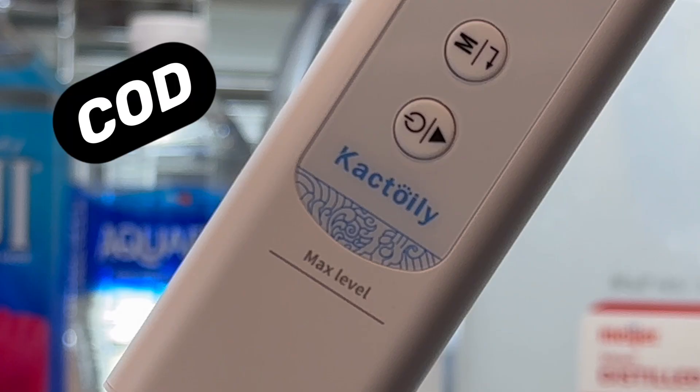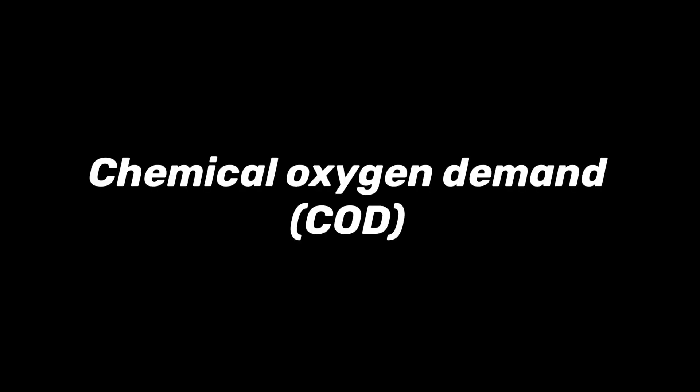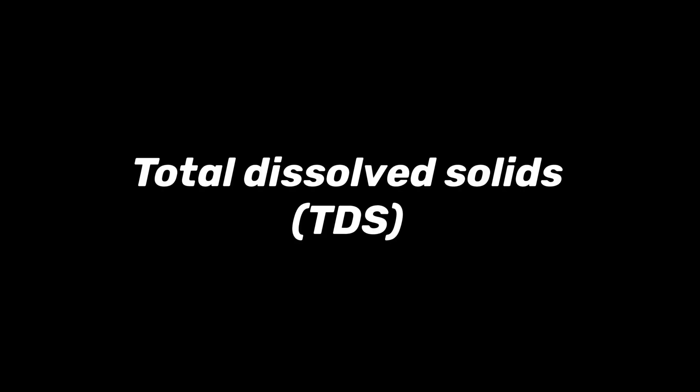This device can give you six different indicators of water quality, but we're only going to focus on three. The first is the chemical oxygen demand, which is just a crude measurement of how much pollution is in the water. The total organic carbon represents the concentration of organic substances in the water, and the total dissolved solids indicates how much material, both organic and inorganic, are contained in the water.